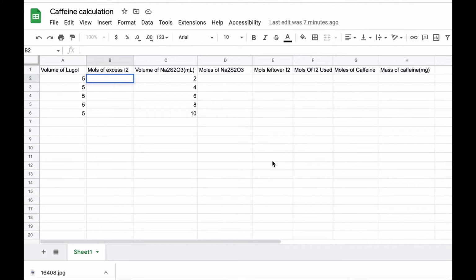Okay guys, I highly suggest that you use a spreadsheet to do these calculations. I already made a video to show you how to do the calculations, so you have an understanding of that. So here I'm just going to use a spreadsheet to do the same exact calculations that I did before.